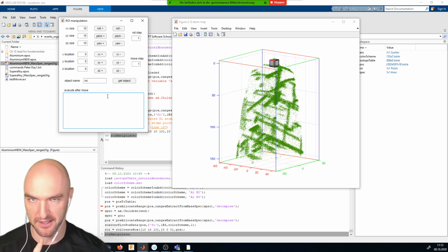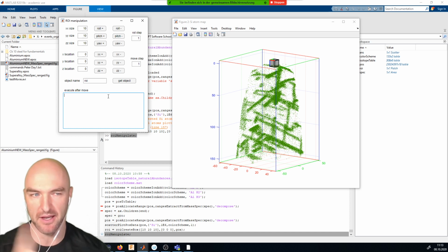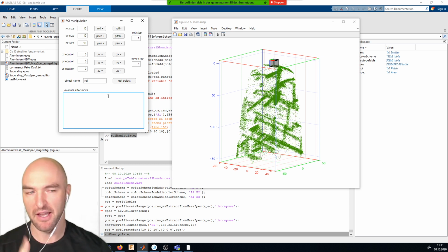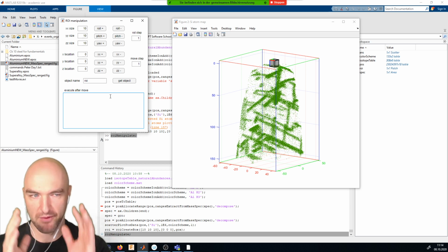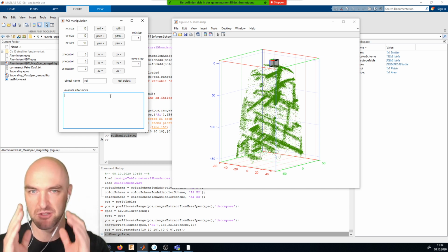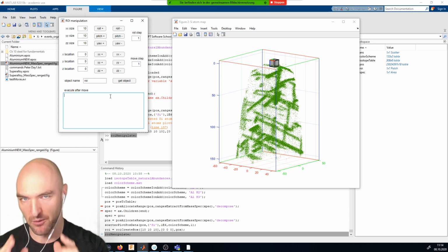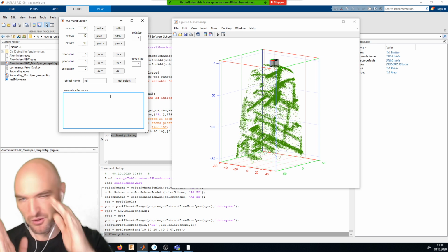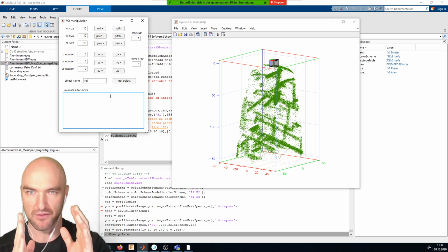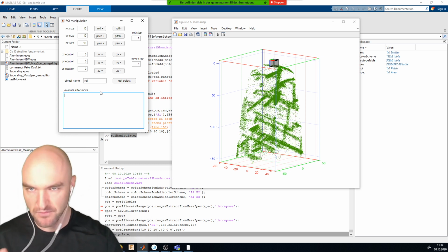The two main things that we do with that is that if we, for example, do a concentration profile based on our region of interest, we can always recalculate it after each step. This is one thing. And another thing that is very helpful is that if we, for example, want to see atomic planes in our atom probe data, and we want to have a region of interest that is perfectly aligned with the atomic planes, then it's really cool that we can open up a second visualization. So we can open up a second scatter plot where we only display the atoms that are within the region of interest and align them with the region of interest. And so you can very, very finely move around your region of interest until it's perfectly aligned with the coordinate system, until the planes are perfectly aligned with that.